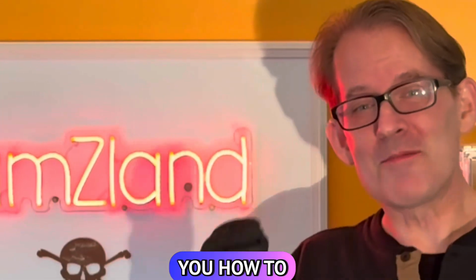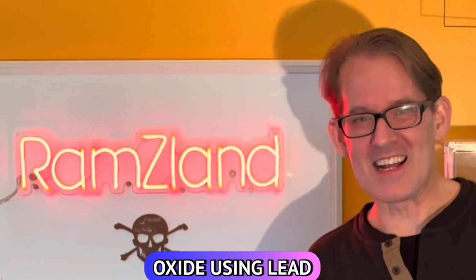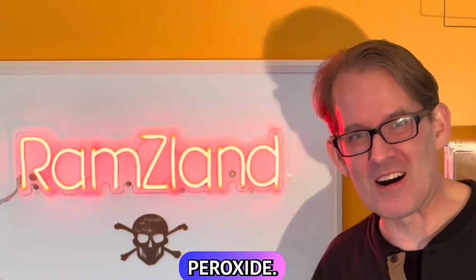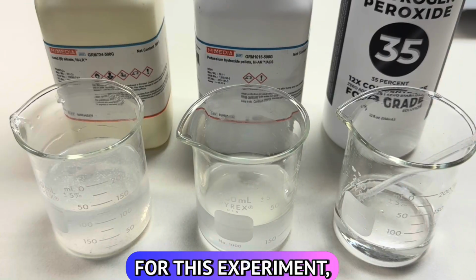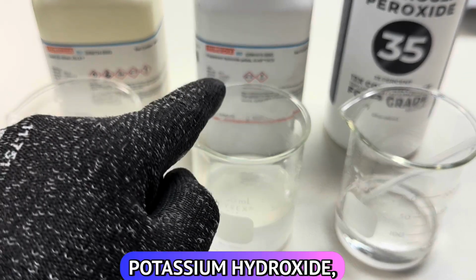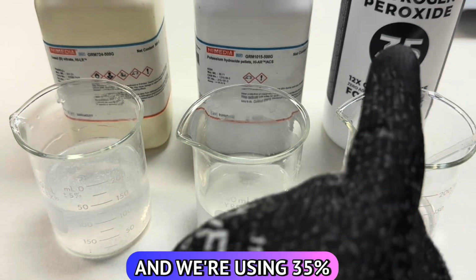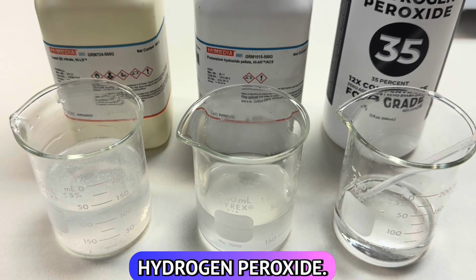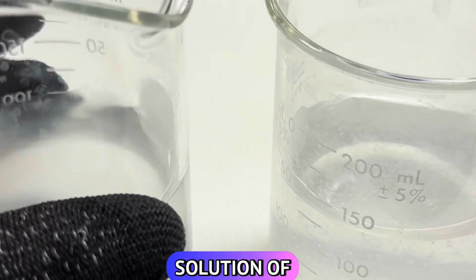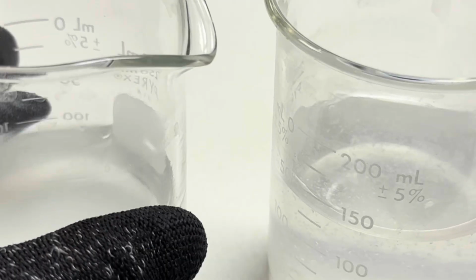Today I want to show you how to precipitate lead oxide using lead nitrate, potassium hydroxide, and hydrogen peroxide. Check this out. For this experiment, we're using an aqueous solution of lead 2 nitrate, potassium hydroxide, and we're using 35% hydrogen peroxide.